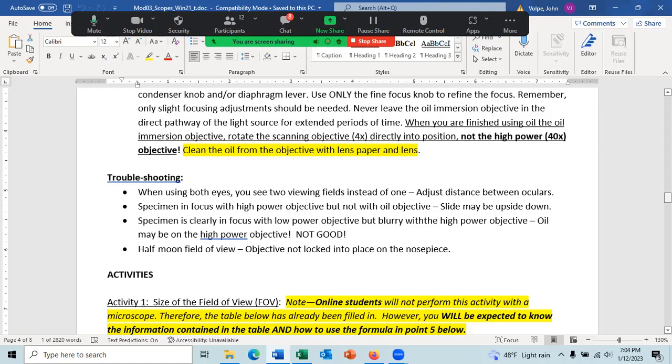Wood fibers can scratch the lenses, and the lenses are the most expensive part of the microscope. So we use lens paper, which is paper, but it somehow is treated to remove the wood fiber from the paper. So lens paper does not scratch the lenses, and generally students only clean the lenses with lens paper.